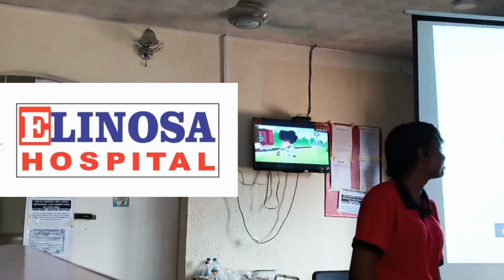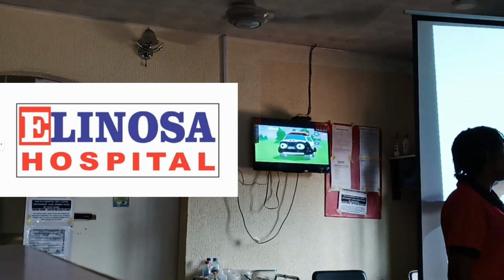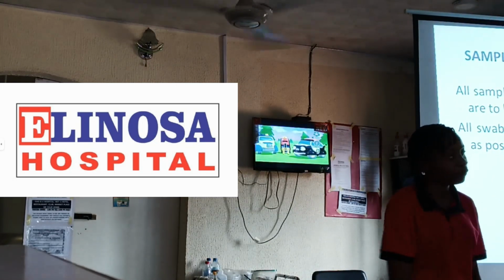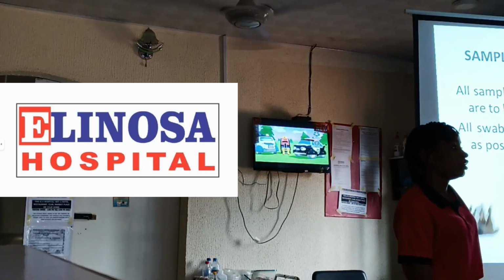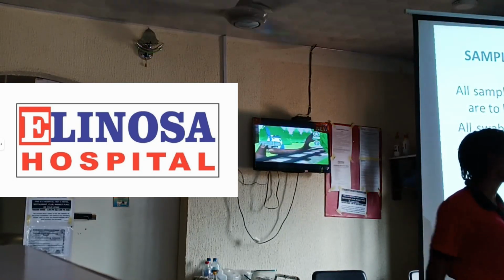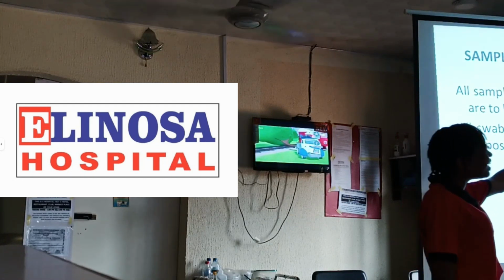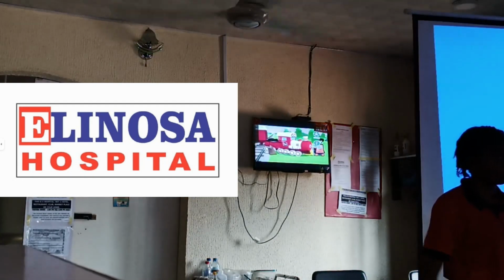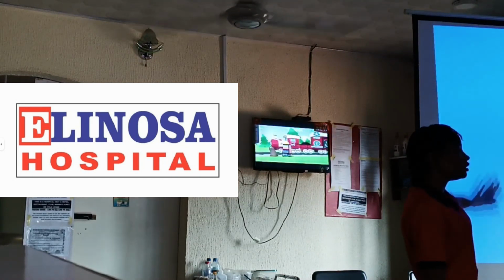Next slide, please. Sample preservation and storage. Now, after you must have collected your sample, you need to preserve them before storing them. The preservation comes before storage. So all samples with the exception of your swab samples are to be stored in the refrigerator. Now let me explain this.